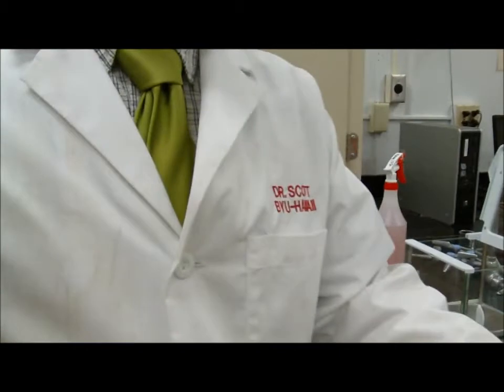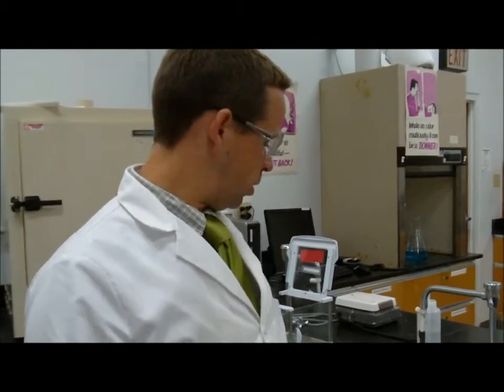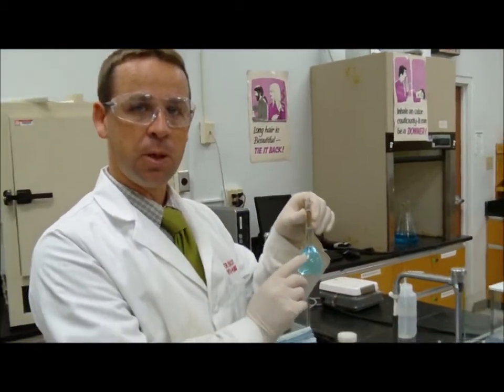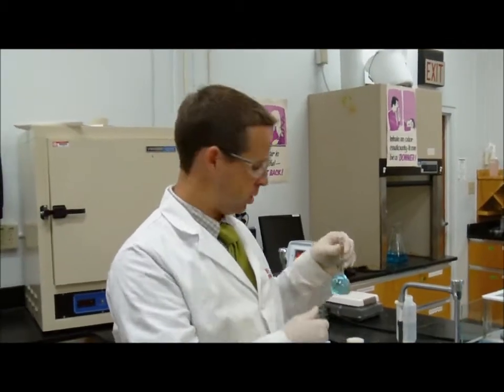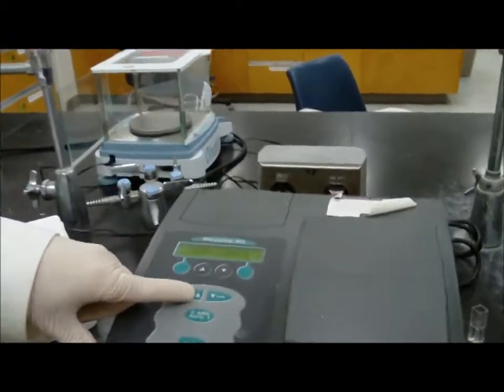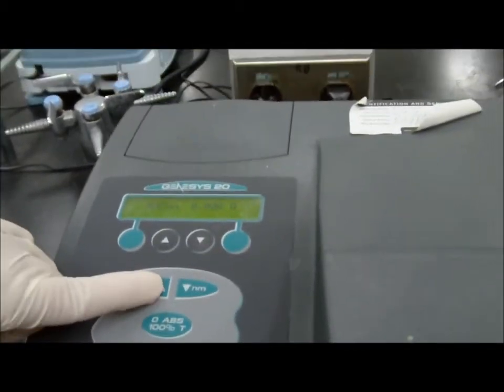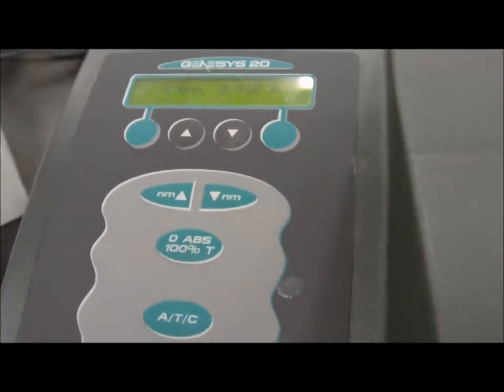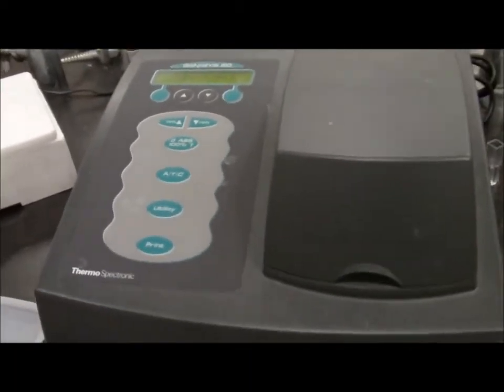Okay, I knew previously that my wavelength of interest is around 810. If we didn't know that, then we could put a sample of this in there and scan the different wavelengths to find where the maximum absorbance value is. But I know that this absorbs light at a wavelength of 810 nanometers. So I can set this to 810. And again, it could be 800, it could be 805, something in there.